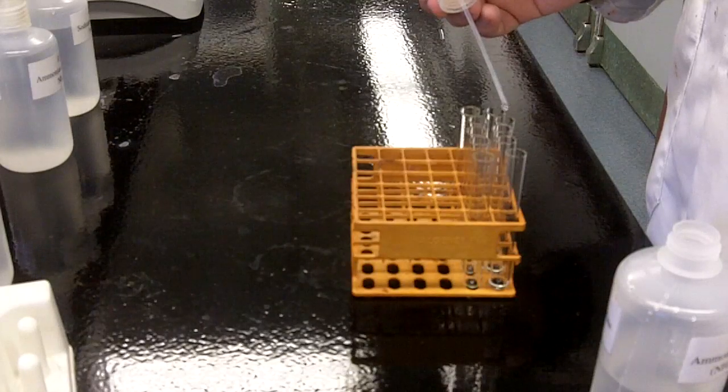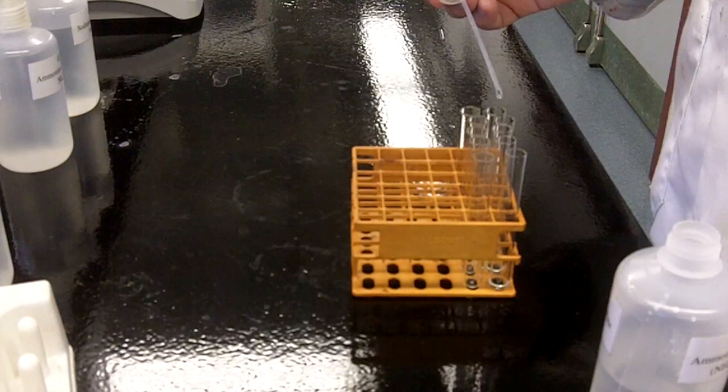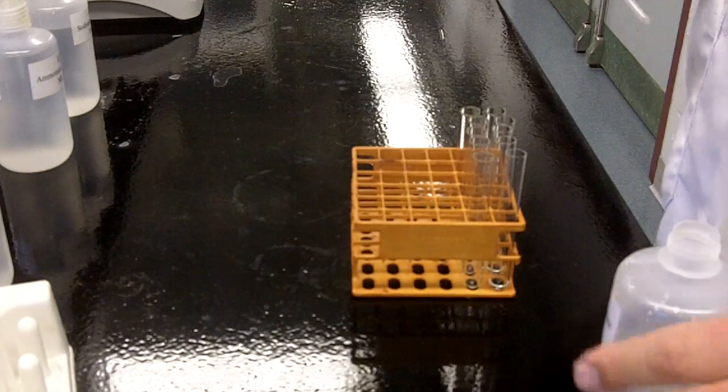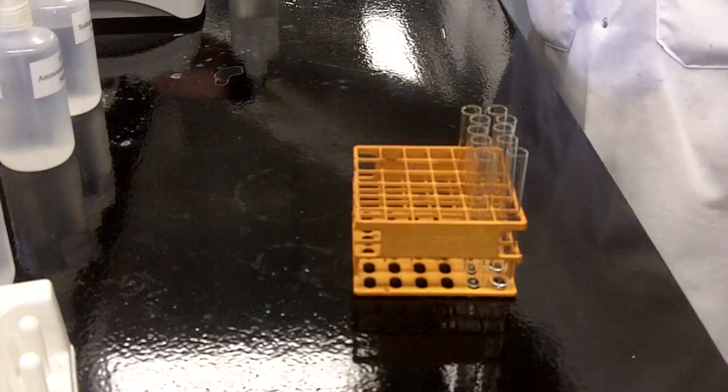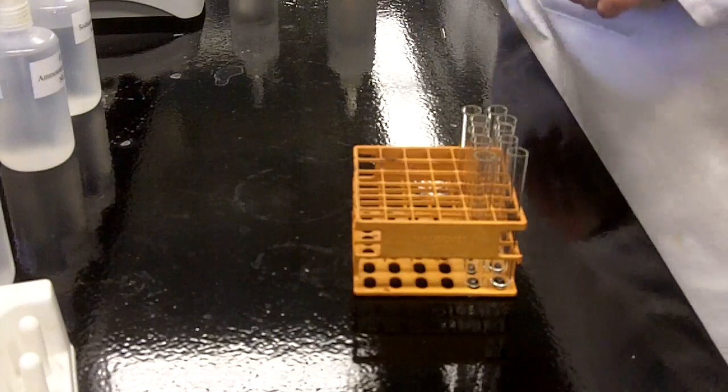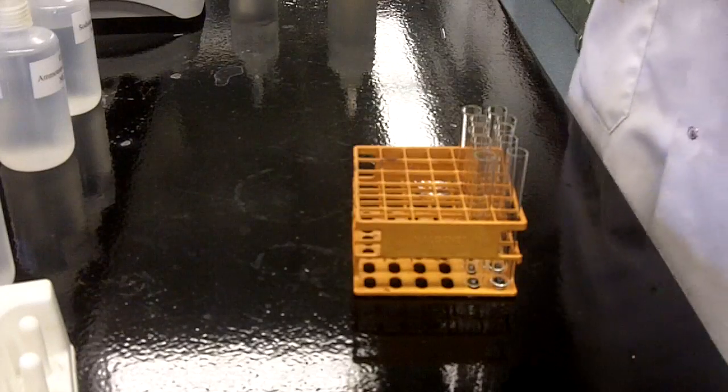You can identify how you want to do that. My suggestion is to do it just like the manual has it laid out in a grid. At that point, you can set up all your cations first and then add the anions and make the observation.